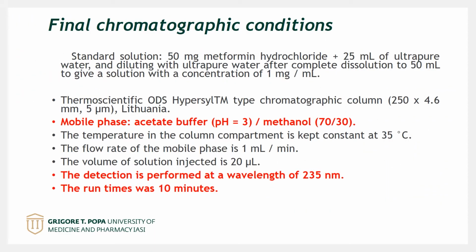The final chromatographic conditions are displayed on this slide. On these conditions, the validation of the method for determining metformin hydrochloride is performed.